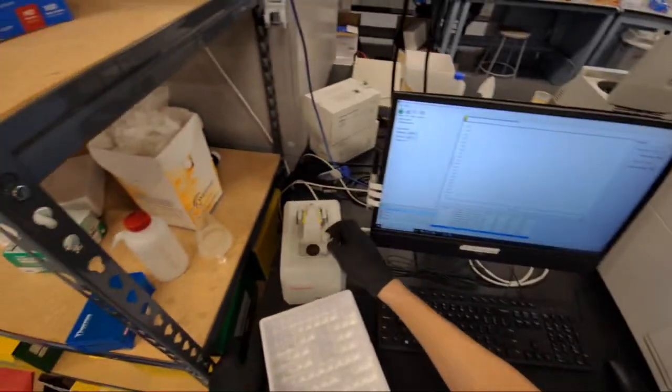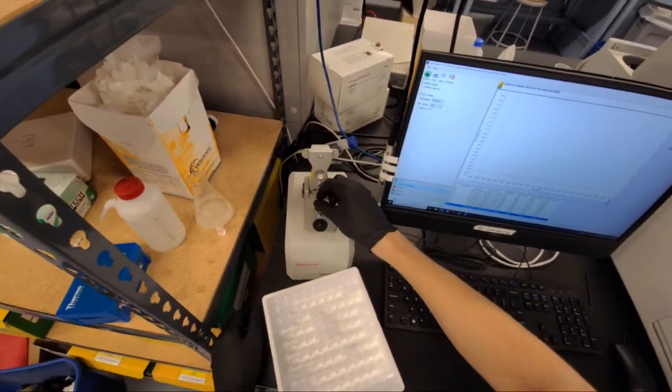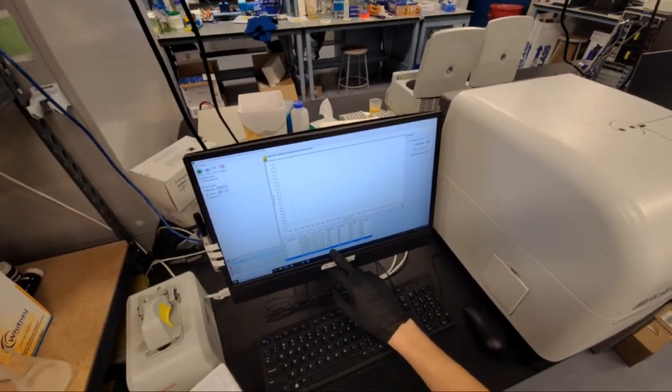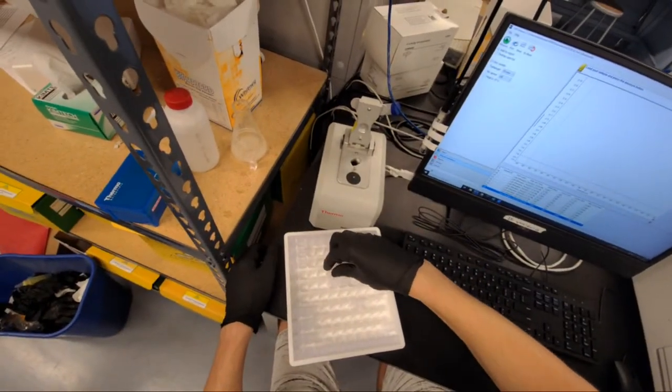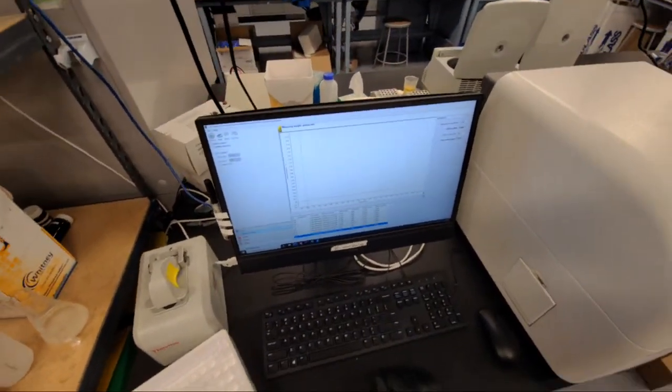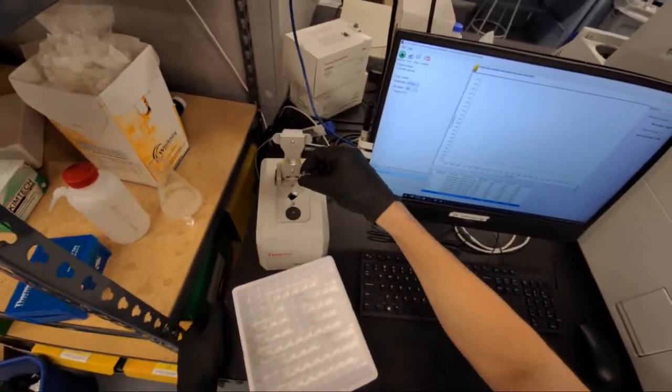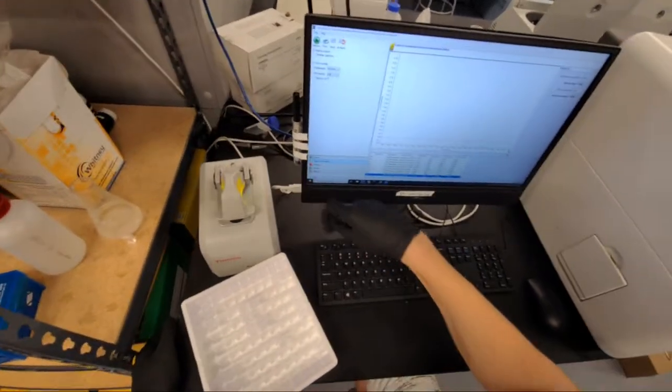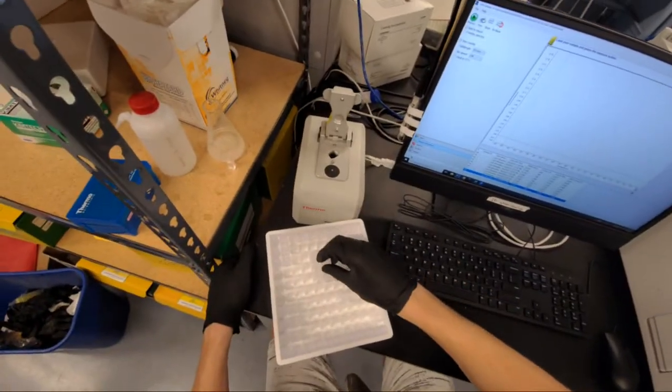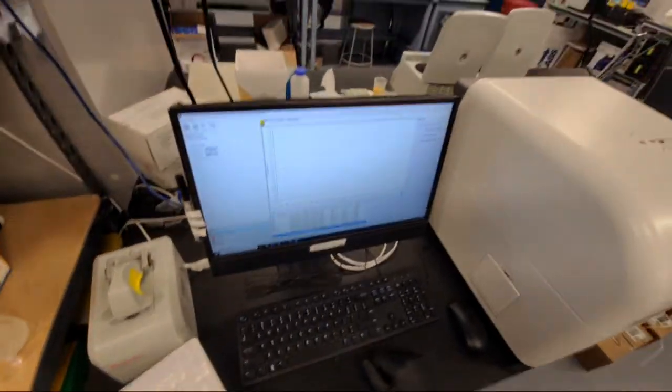So this first sample is 0.446. And then here's a technical replicate of that sample. So we should get about the same number. 0.446. This one is 0.444. It's pretty good. This next one. So that one was 0.359.